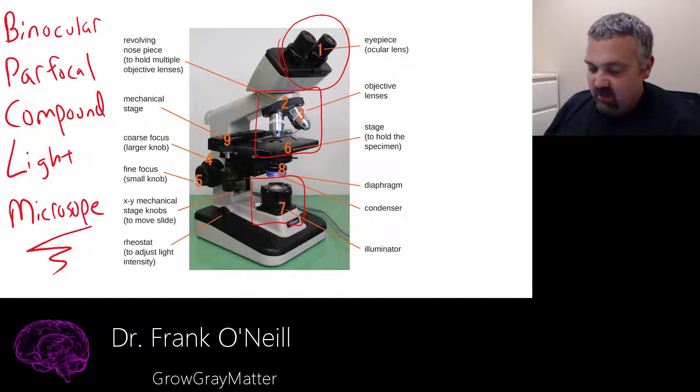The light source is actually what powers this process. So it is visible light that travels through your specimen, and that's what allows you to see it. So visible light has a pretty long wavelength, which is the reason that we can't get great resolution and magnification.